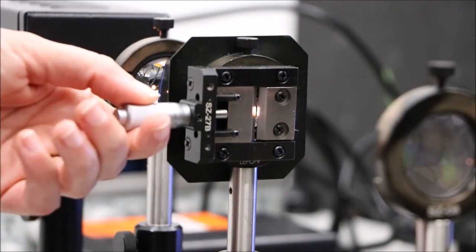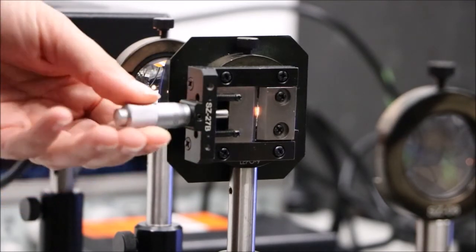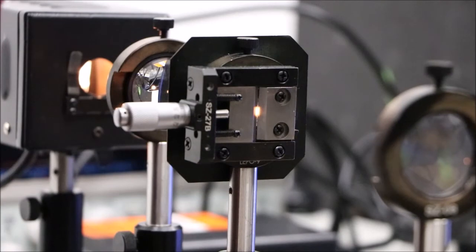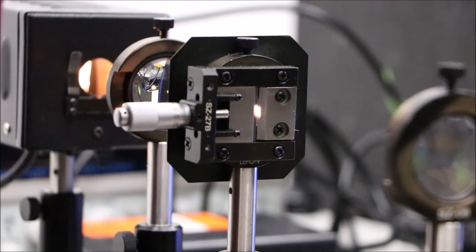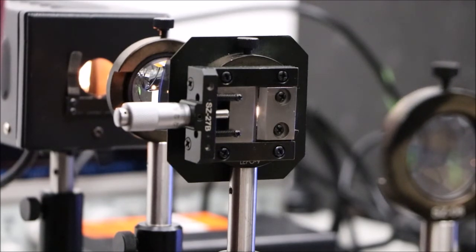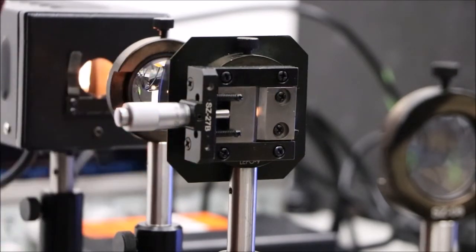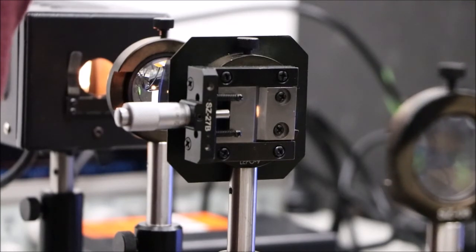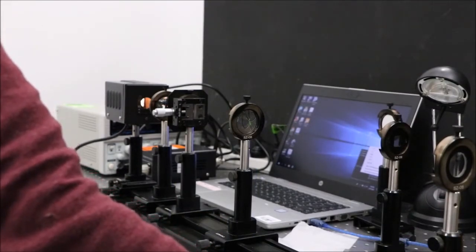We'll narrow the slit and repeat the autocollimation until the line is as narrow as possible. Now we'll slide the screen along the rail so the image of the slit on the screen is focused.